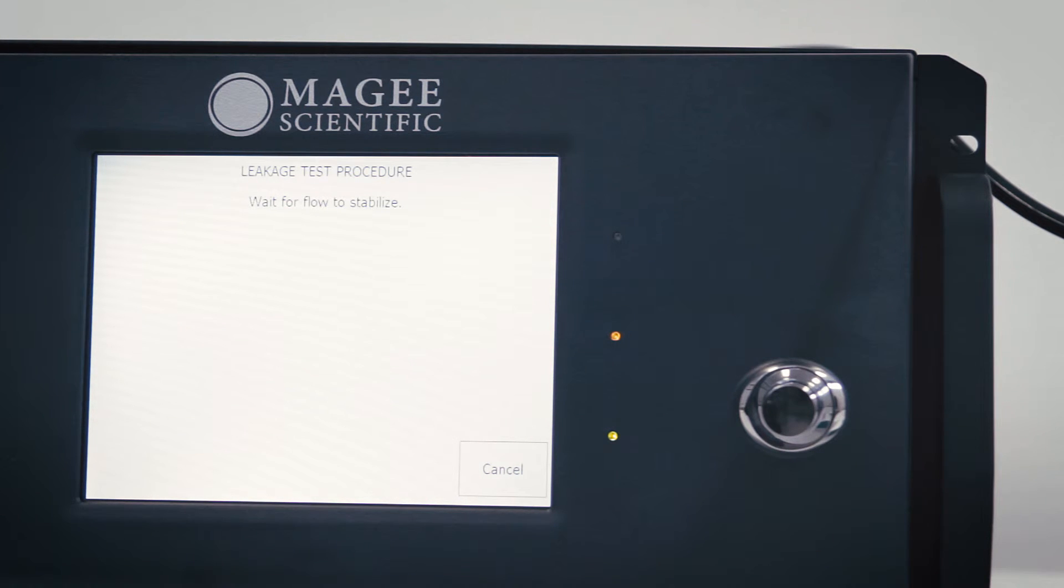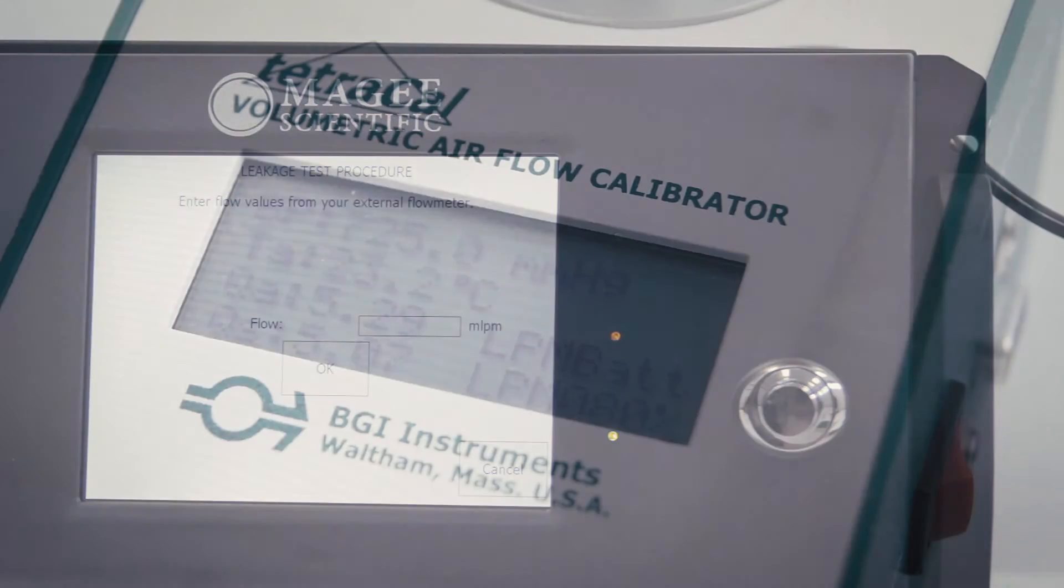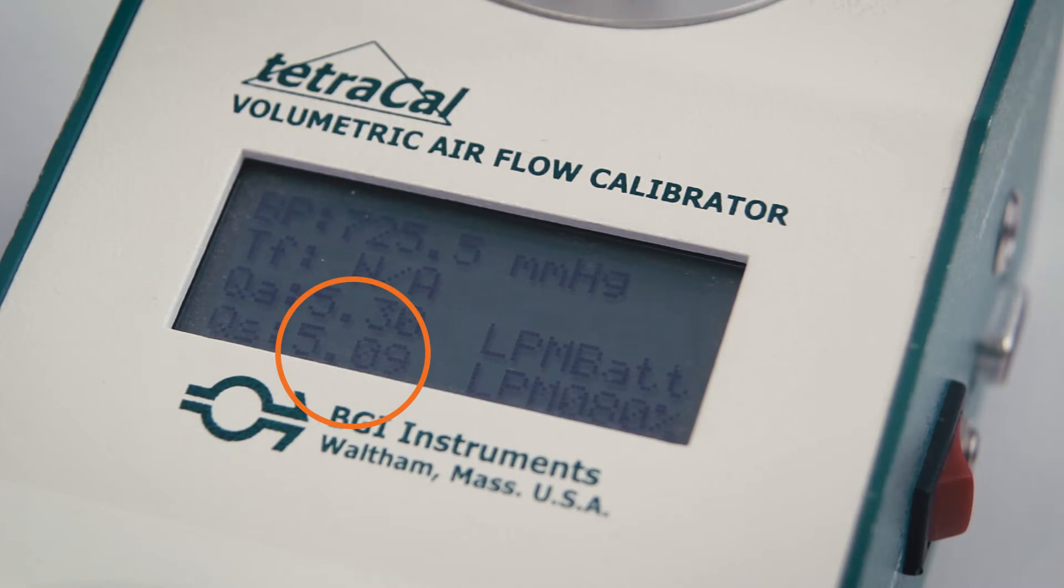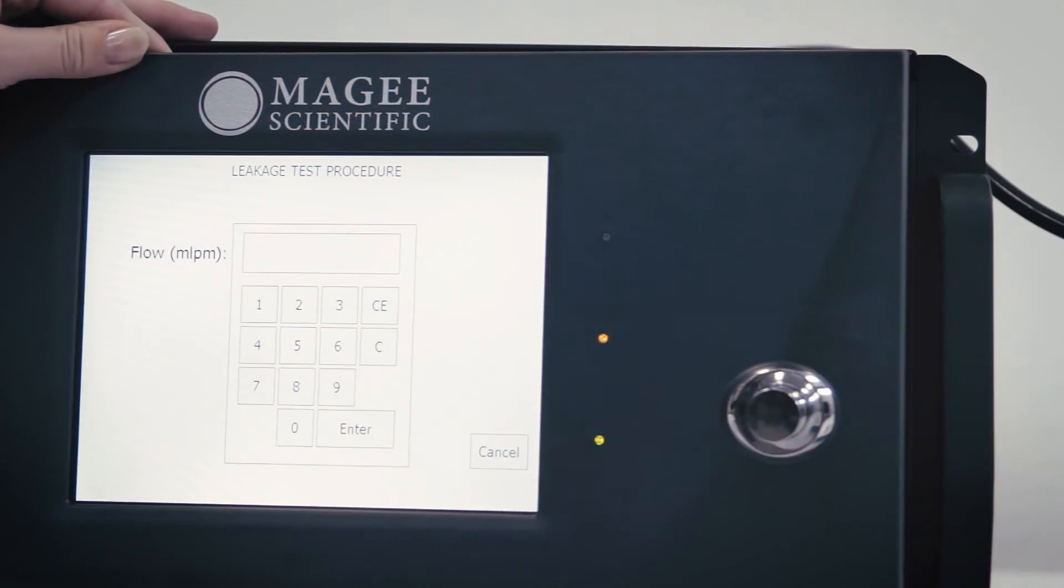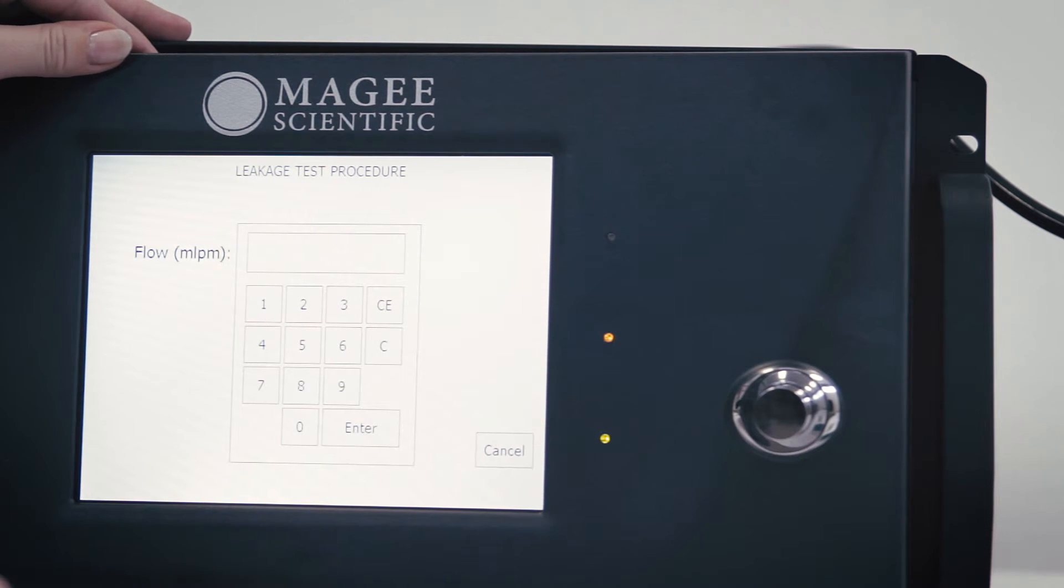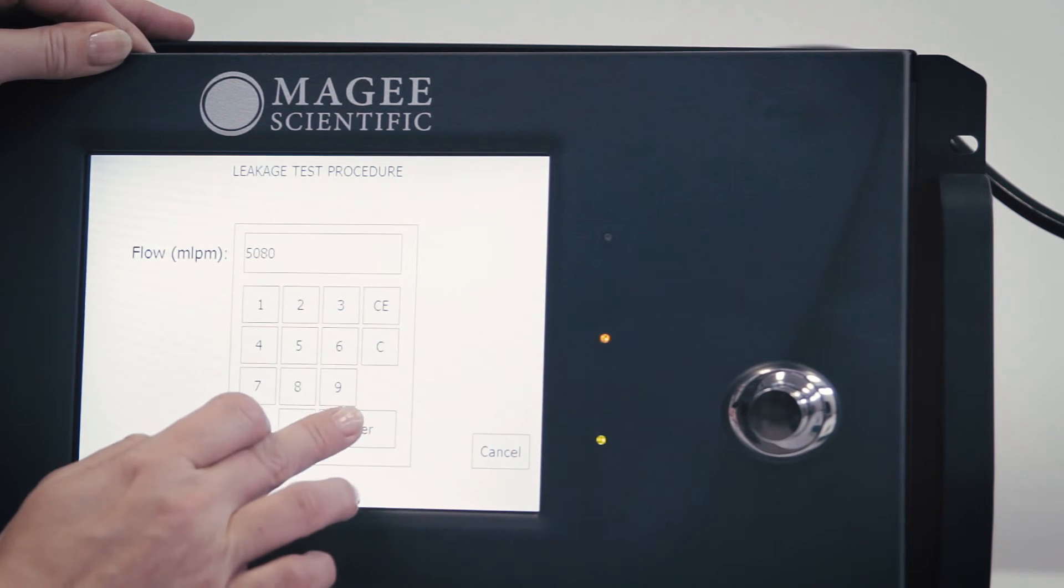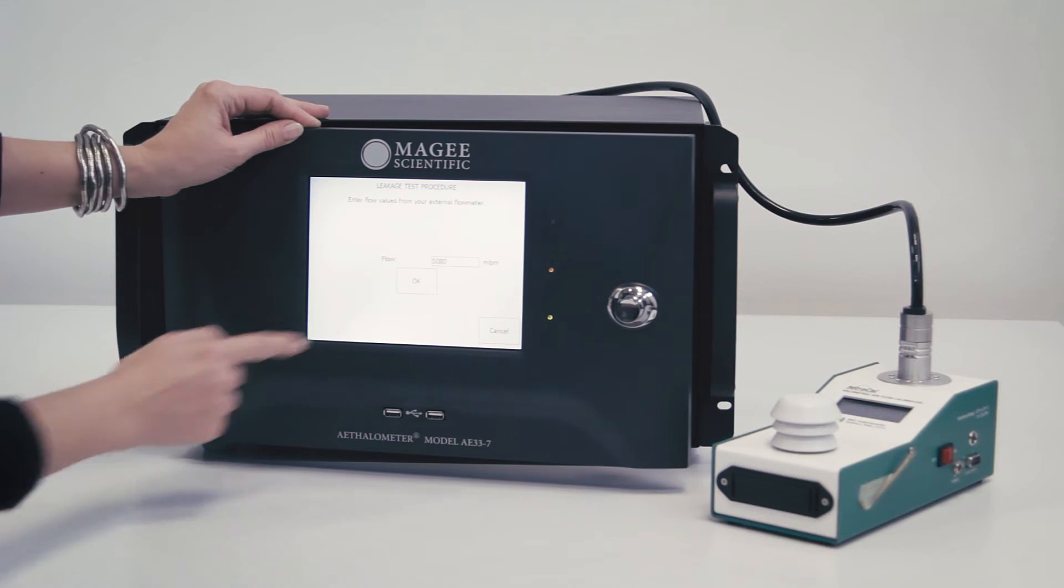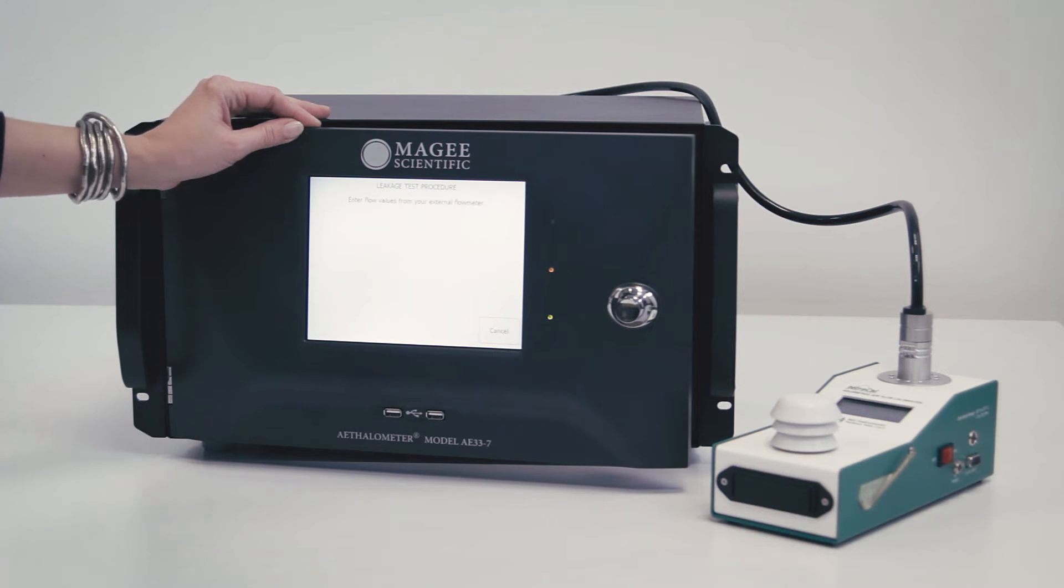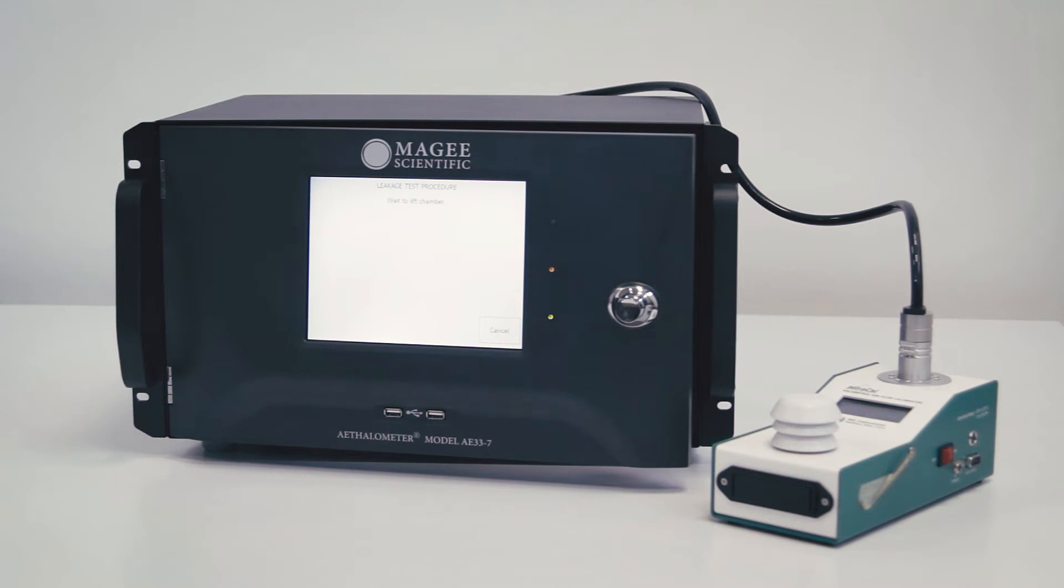Repeat the procedure as before when measuring the flow.